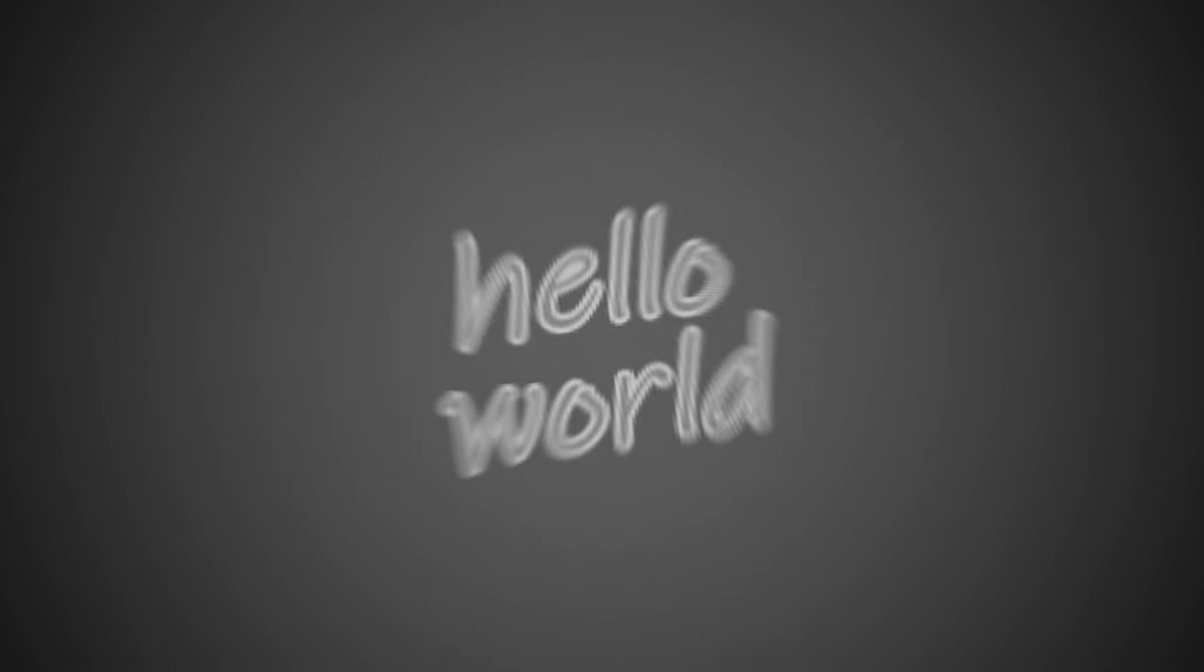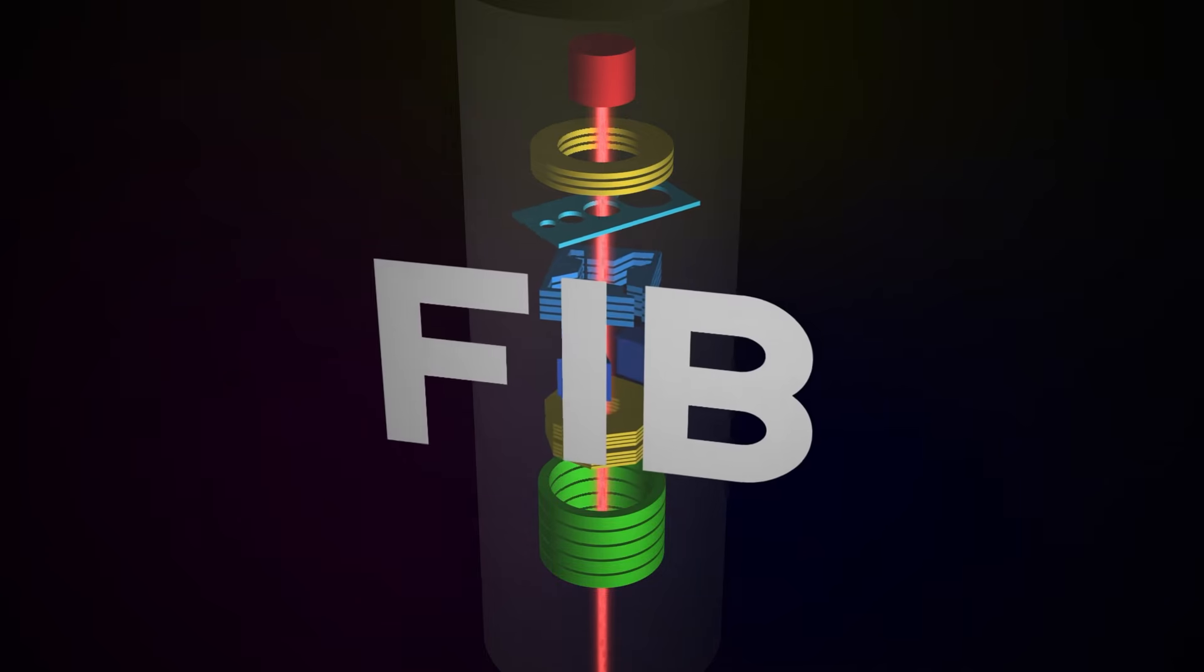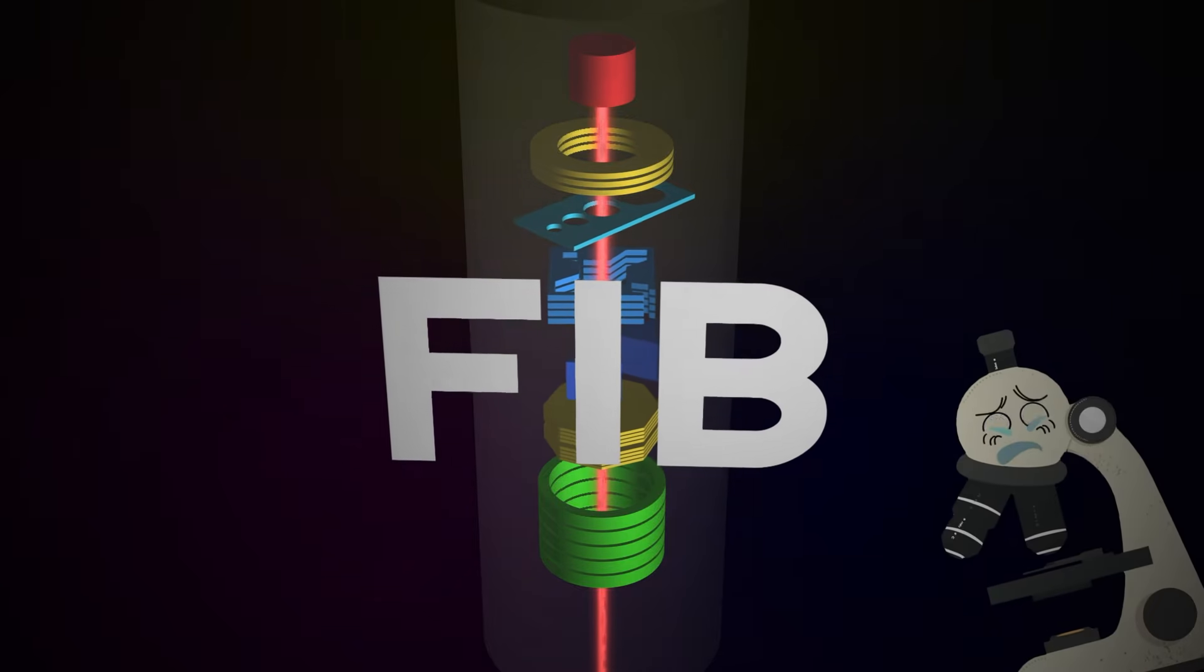Did you know it is possible to write smaller than the human eye can perceive? Universities and industries are using a special type of microscope, the focused ion beam, or FIB, to image and pattern at scales invisible even to an optical microscope.